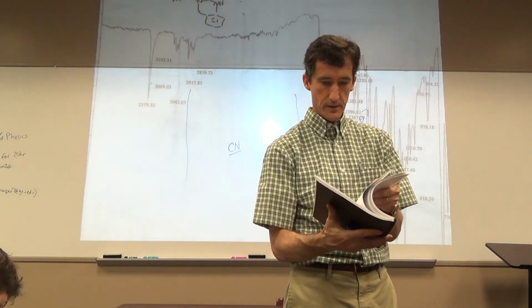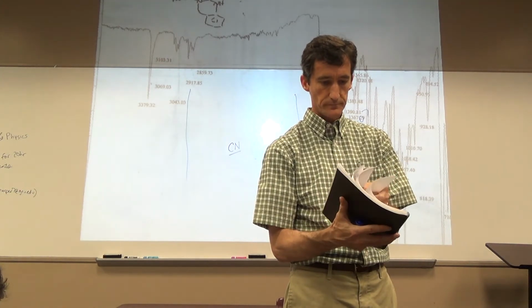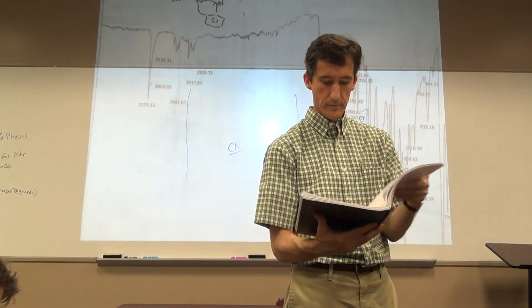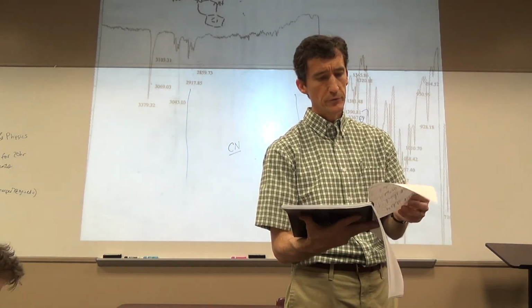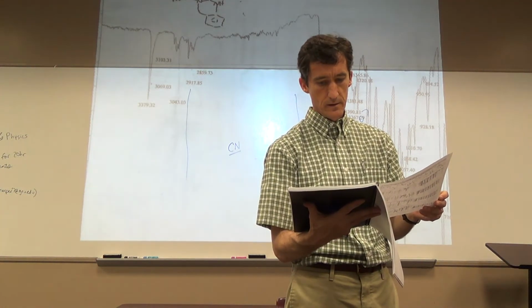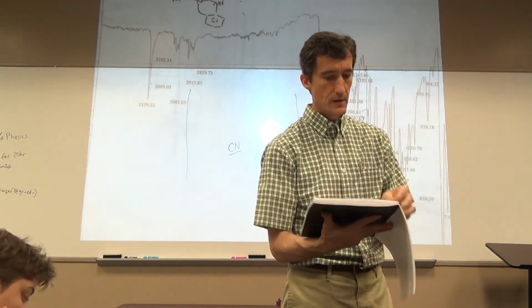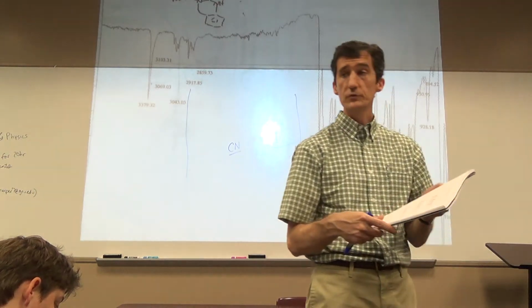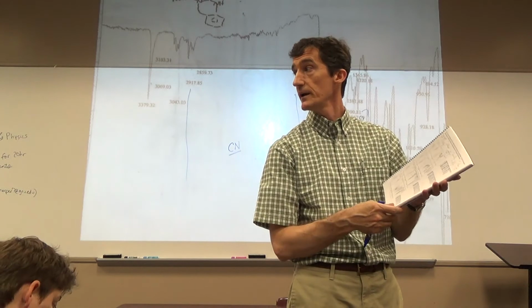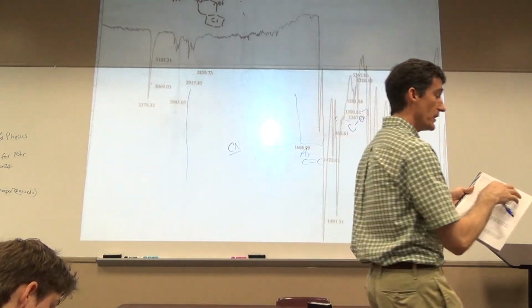Spectroscopies all together, page 33. That's the first one. Starts on 33. You will see something like this on the test. Compounds at the top, a choice of compounds, and the idea is to assign each spectrum a compound. Not all the compounds will be used.